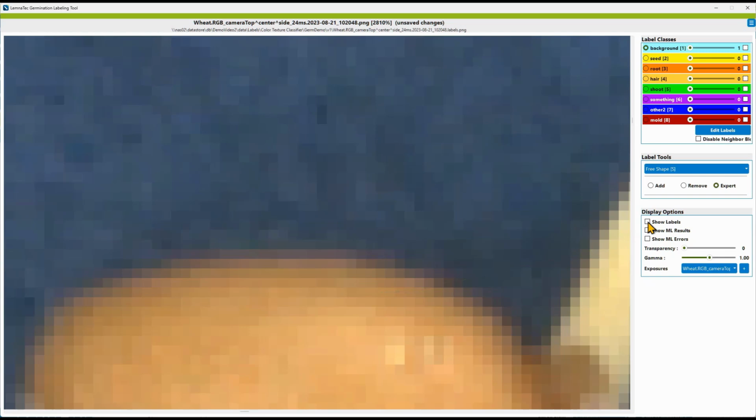However, it is important to label borders between classes. These pixels are the hardest for the machine learning model to predict because they are surrounded by a mixture of different types of objects. On the other hand, it is even more important to label consistently. But this is particularly hard for these transitional pixels. Therefore, you can use the blocking width to avoid labeling them. By default, the blocking width for the background class is 1, 0 for all other classes.